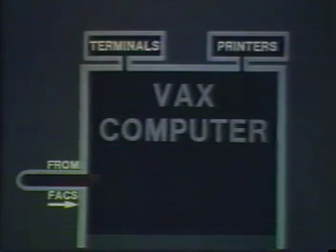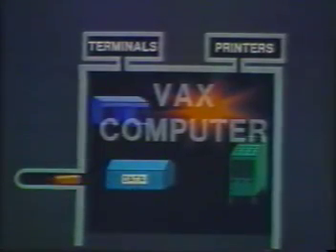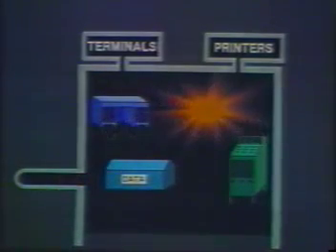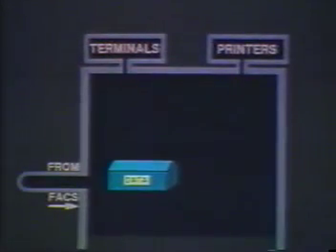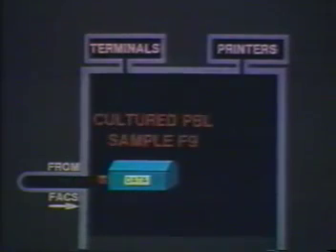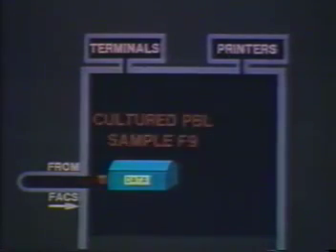To understand how these 4-parameter cell data packages get labeled, stored, and later analyzed, imagine FACS Desk as a data processing microworld that you control from the computer terminals in your laboratory. In the FACS Desk microworld, there are facilities to handle every aspect of running an experiment. The facility which stores and labels the raw data as it arrives from the FACS can be thought of as a data warehouse. Inside the warehouse, each cell data package gets labeled with an experiment and sample number and receives a unique storage address so that it can be found for subsequent analysis.